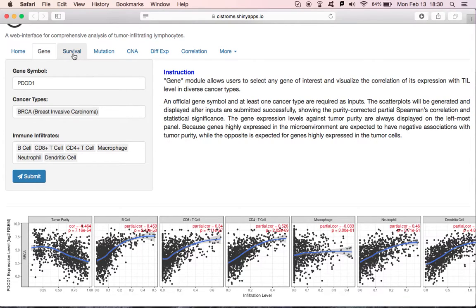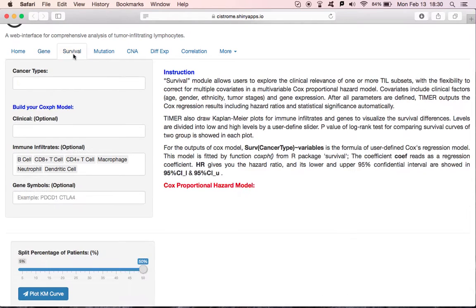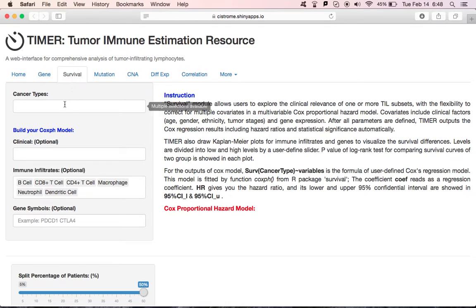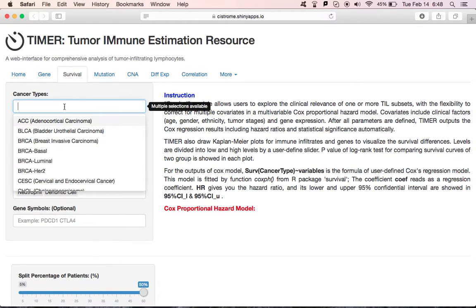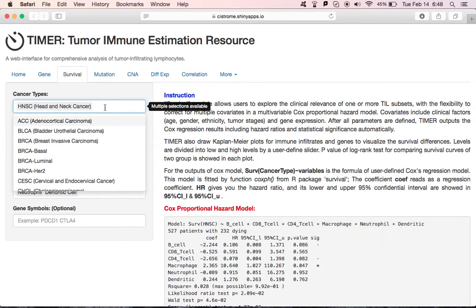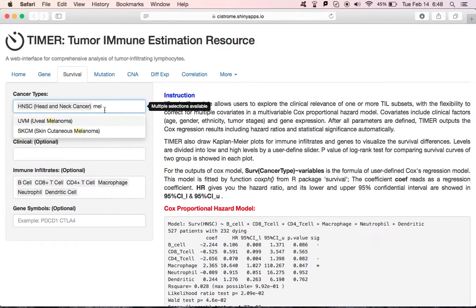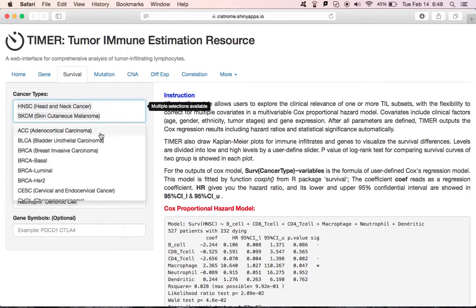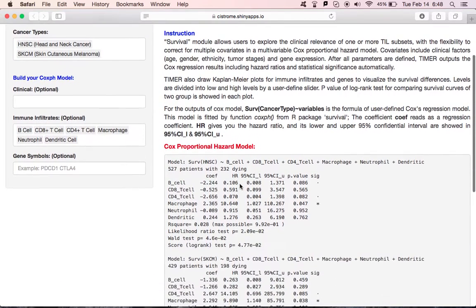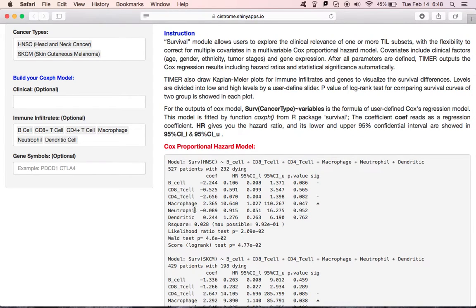The second module is for survival analysis. This module is to investigate the clinical relevance of tumor infiltrating subsets. It provides the Cox Proportional Hazard Model. First, choose cancer types. Here, we will try head and neck cancer, as well as melanoma. We have seen the result displayed here. The Cox Model result is calculated for each cancer type, respectively.